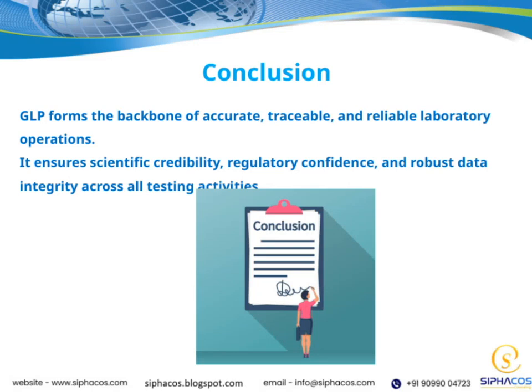GLP, or Good Laboratory Practice, forms the backbone of our laboratory operations. It's what ensures that our work is accurate, traceable, and reliable every step of the way. When we follow GLP standards, we're not just doing things by chance, we're maintaining scientific credibility that others can trust.